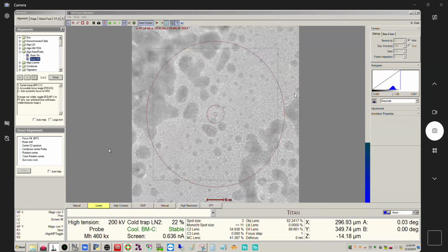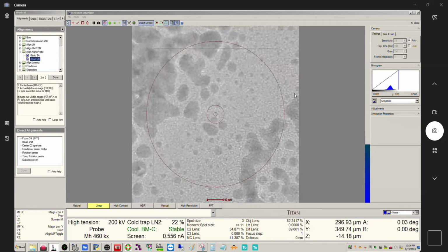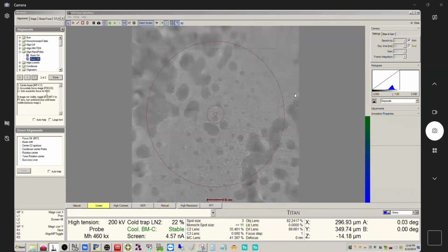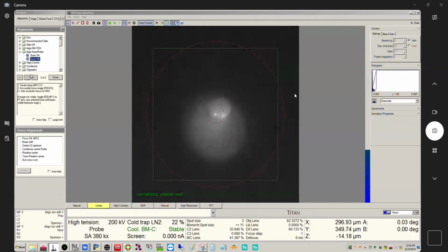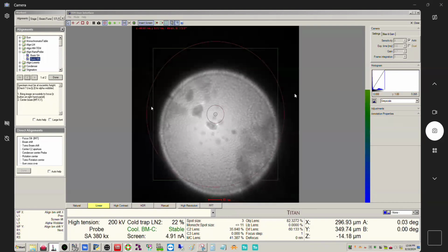Okay. So now this is different here. This is in MH mode. I'm actually not going to adjust this here, but basically it's just asking us to center the image. You know what I'm going to do actually? I didn't keep track of where this was, because it's giving us a mag correction. All right, let me go back here. I don't like doing that, but let me do it anyway. I didn't pay attention. Okay, so there's my.